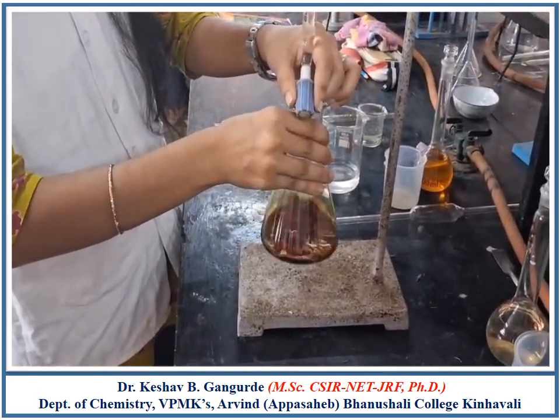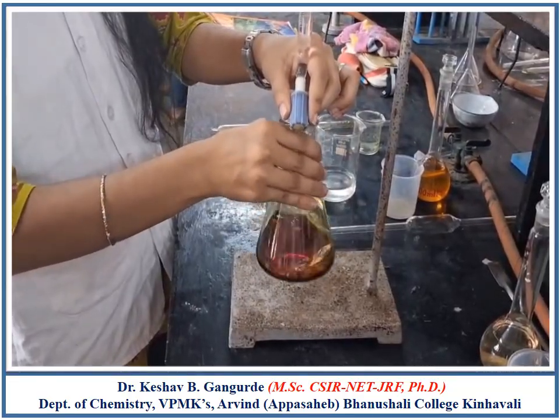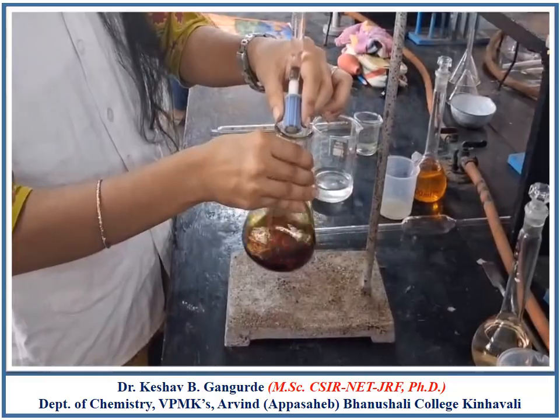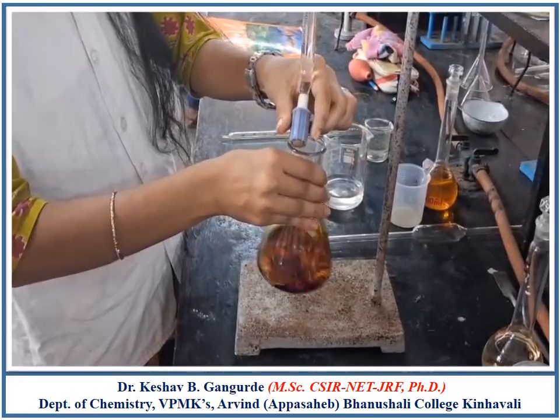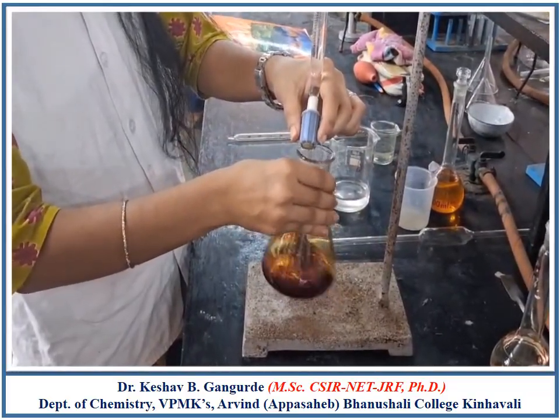Remember, in the blank titration we are adding same reagents used in back titration, that is estimation of glucose. Only the change is that instead of taking honey sample solution, we have taken 10 ml of distilled water.